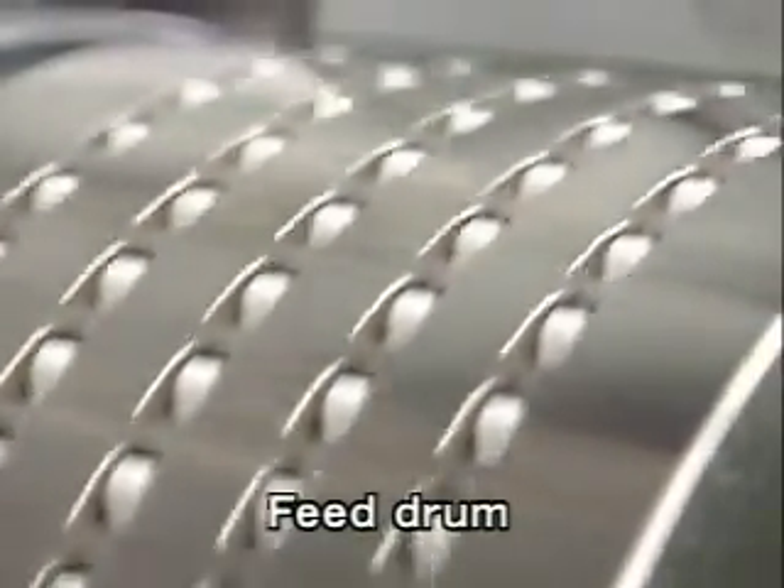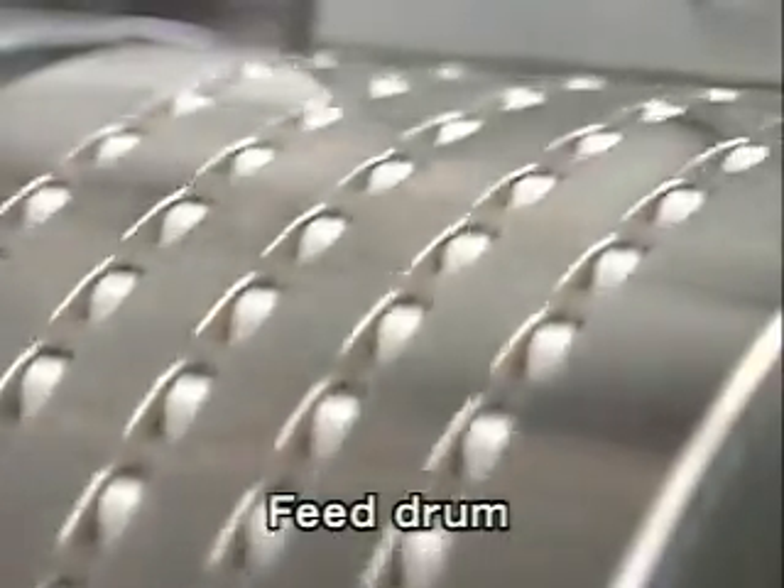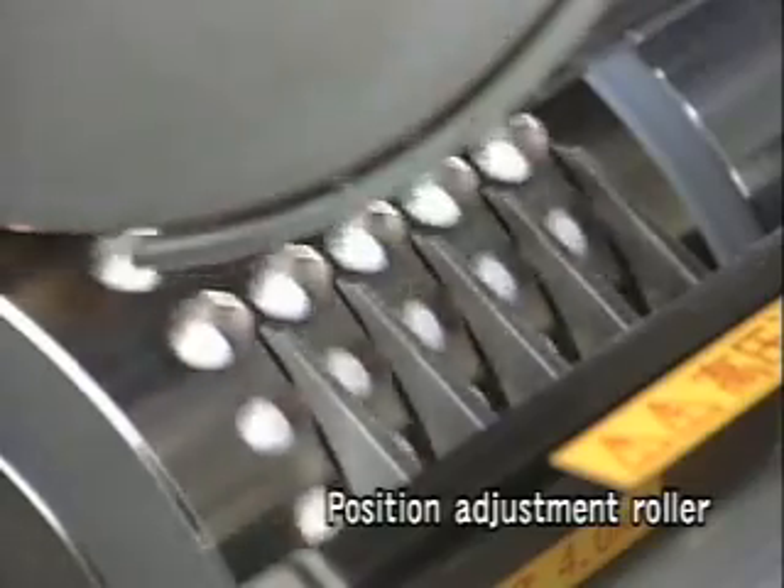Via the vertical supply pocket in the supply drum, the tablets are transported to the rectifier roller that alters the tablet orientation to the horizontal.